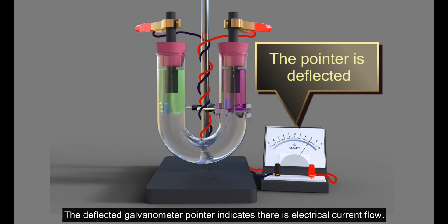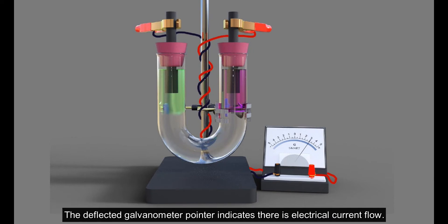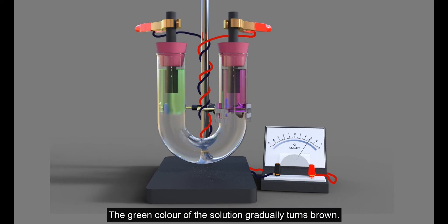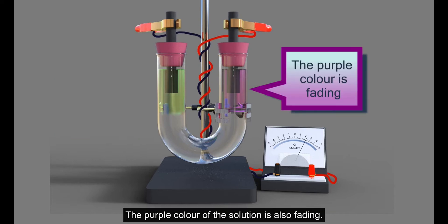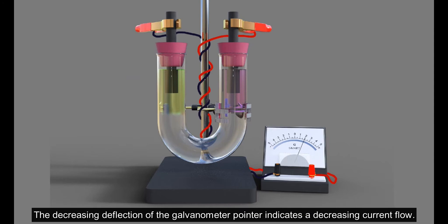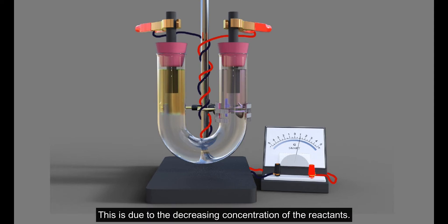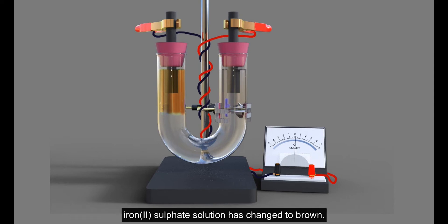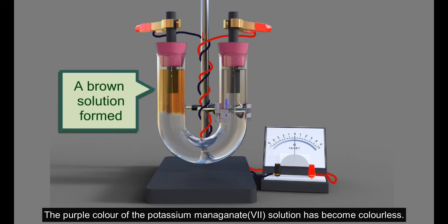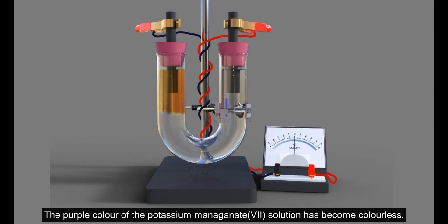The deflected galvanometer pointer indicates there is electrical current flow. The green color of the solution gradually turns brown. The purple color of the solution is also fading. The decreasing deflection of the galvanometer pointer indicates a decreasing current flow, due to the decreasing concentration of the reactants. At the end of the reaction, the green color of the iron(II) sulphate solution has changed to brown, and the purple color of the potassium permanganate solution has become colorless.